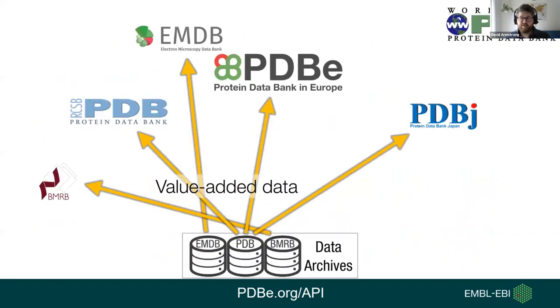However, each of these sites have our own separate websites for presenting the data and sharing these with the research community. And during this process, we have slightly different processes to add additional annotations to the data, some of which will allow you to make different interpretations of the data and to use it in different ways. And so what I'm going to be describing today is the resources available at the PDBe and the way that we present that data to hopefully help you understand more about ligand binding sites.